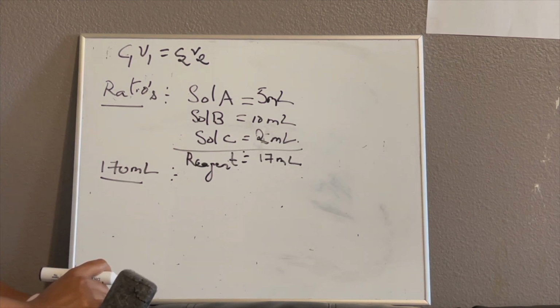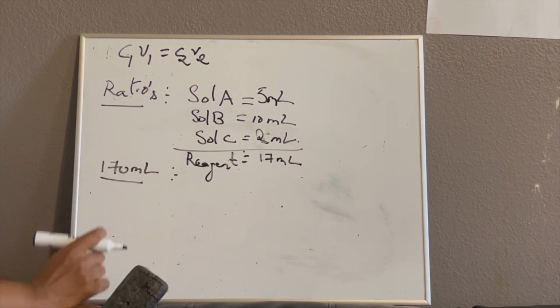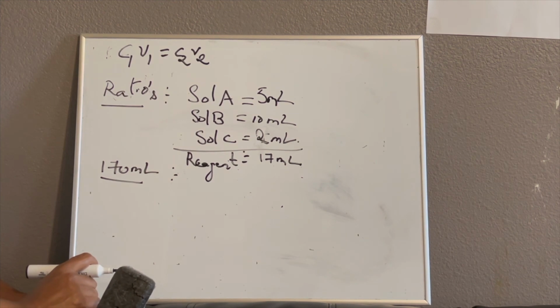And one more thing is we always need to check the expiry dates of the chemicals we have in the lab. It's very, very important, because if you work with an expired chemical, it may not give good or desired results, which means the assay fails, because things were not working the way they should. So we always need to check for the expiry of the chemical or the reagent.